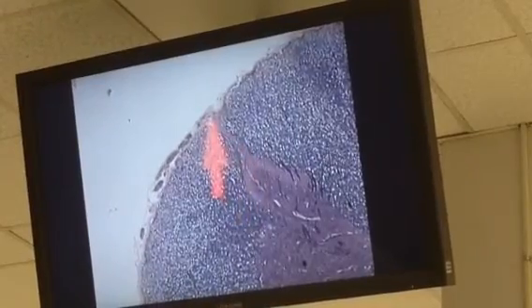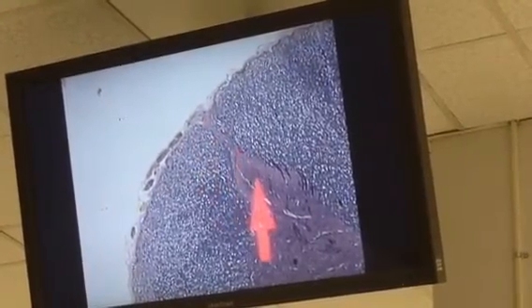Up here is where the dorsal root fibers would enter, bringing sensory information of a local nature into the dorsal horn. And down here, you don't see a corresponding ventral root coming out because the axons of motor neurons come out in smaller bundles, like rootlets.